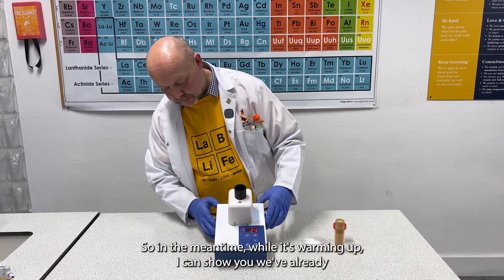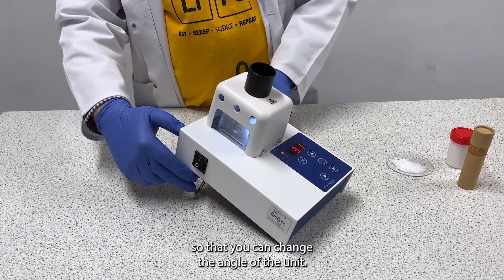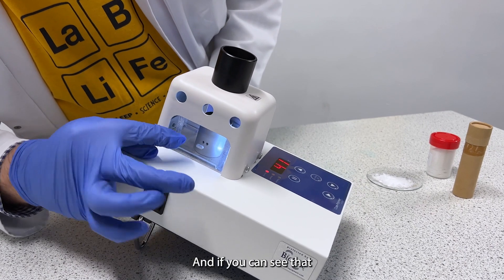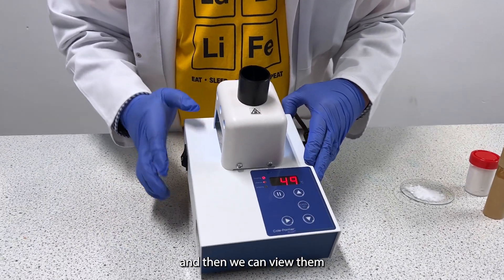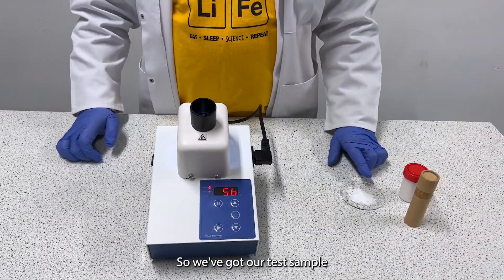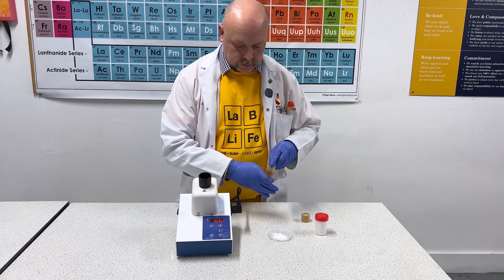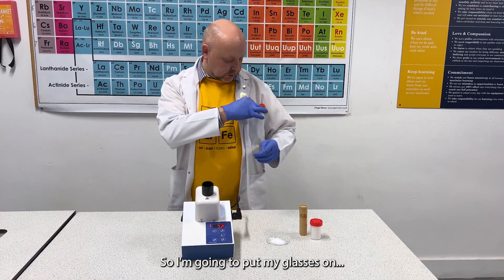In the meantime while it's warming up, I can show you we've already got the unit up on its feet here so that you can change the angle of the unit. When we're going to use our capillary tubes we're going to put them in here, slide them through, and you can see that there are two slots — two troughs that you can use — and then we can view them through this magnified viewfinder here. We've got our test sample that the students have already produced, and in here are our capillary tubes. I'm going to put my glasses on.